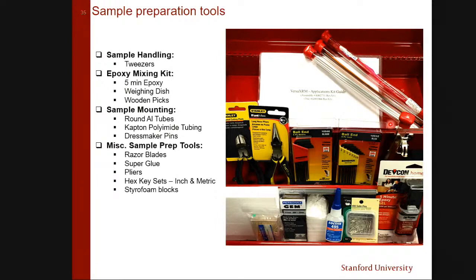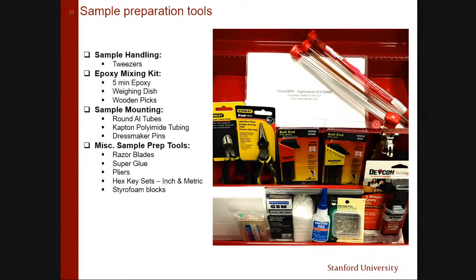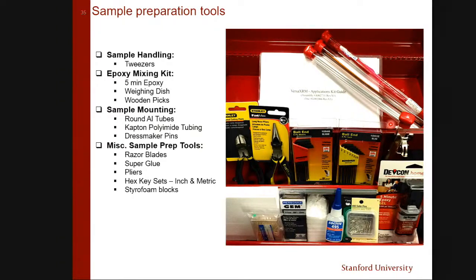For example, if you bring a sample which is moist and it dries out, definitely you will have an artifact. Your sample is moving. You have a drift. So definitely between the first projection and the last projection, the position of a small part in the sample will change. So that's the problem. Usually you want the sample non-movable in this case. And the higher the resolution, the less movable it should be.